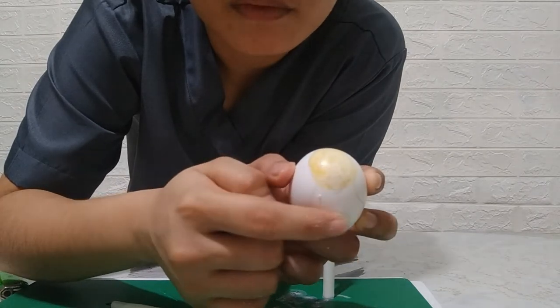You can see that the egg has a smooth seal covering the hole.